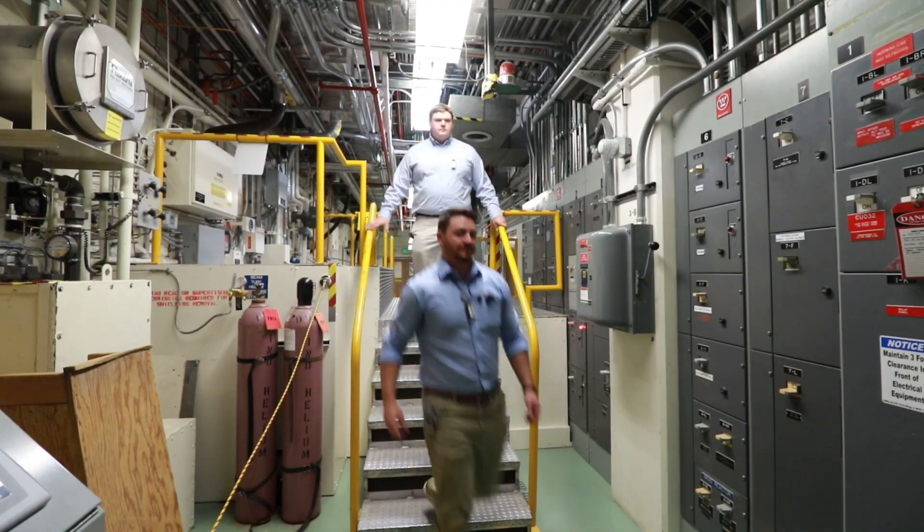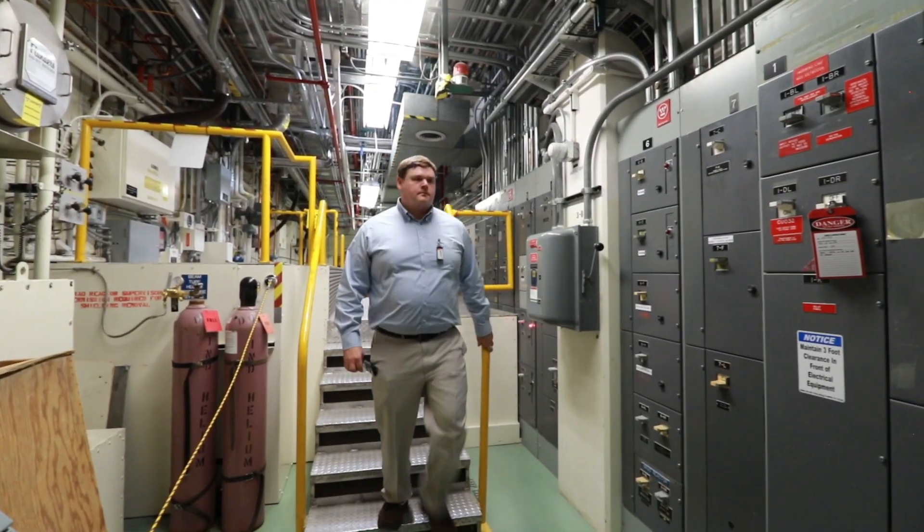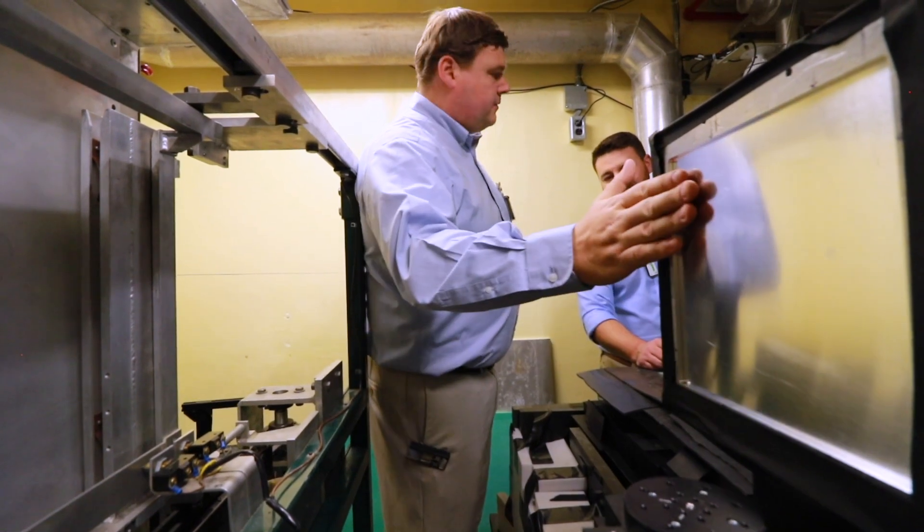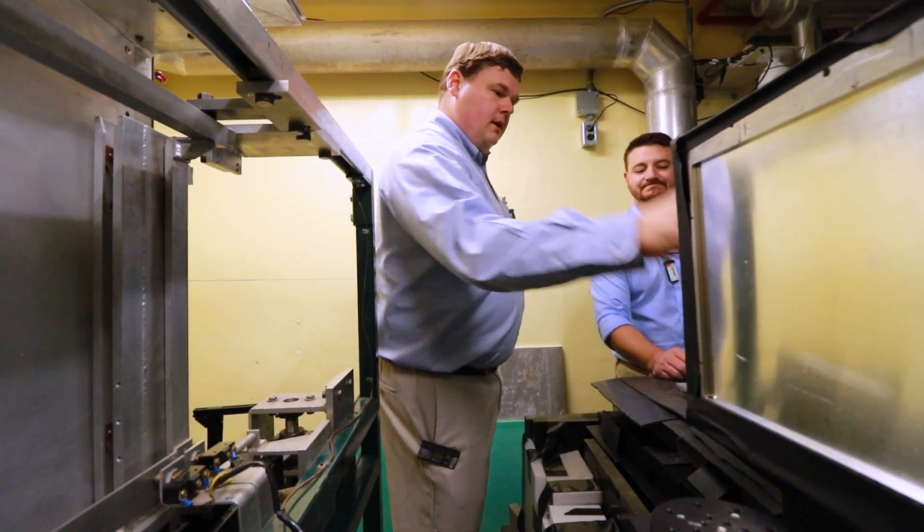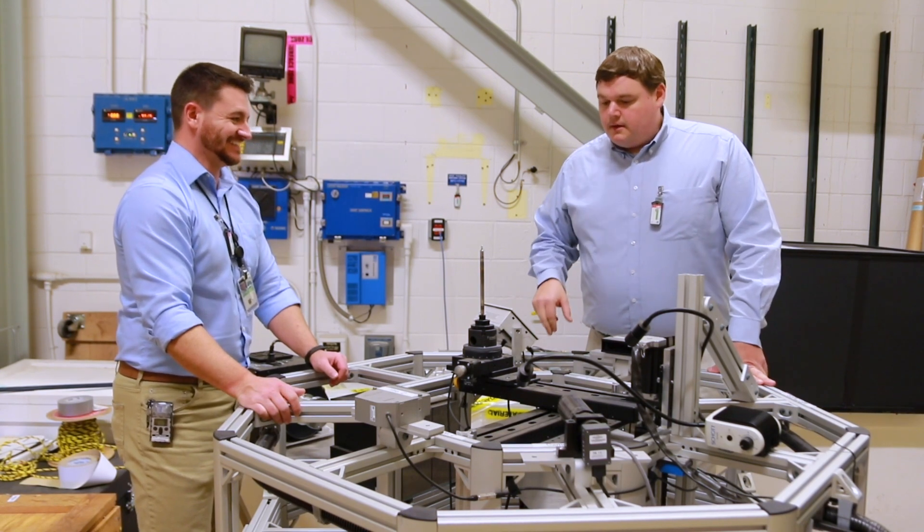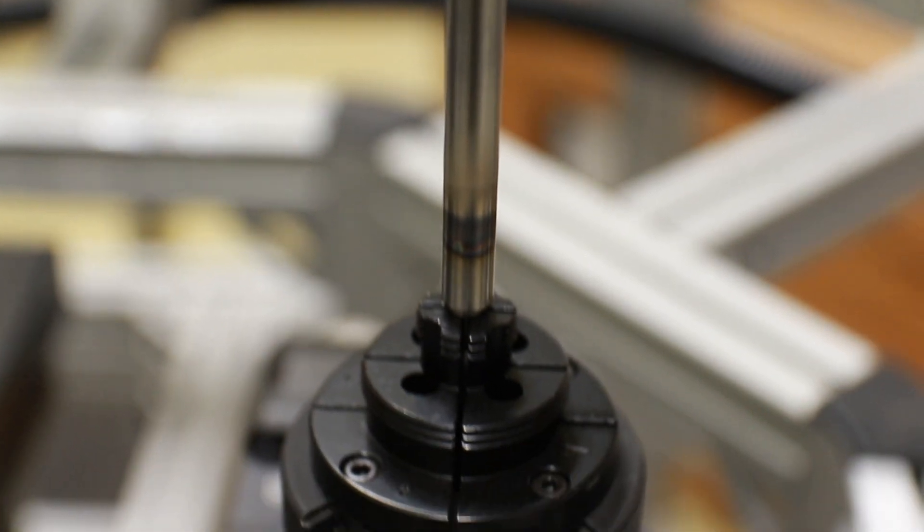The process starts when we manufacture a nuclear fuel here or bring fuel in from somewhere else. We then insert it in one of our reactors for radiation testing. After irradiation, we bring it into the materials and fuels complex to characterize the fuel, first with non-destructive testing then destructive testing to understand both engineering scale and microstructural all the way down to atomistic effects.